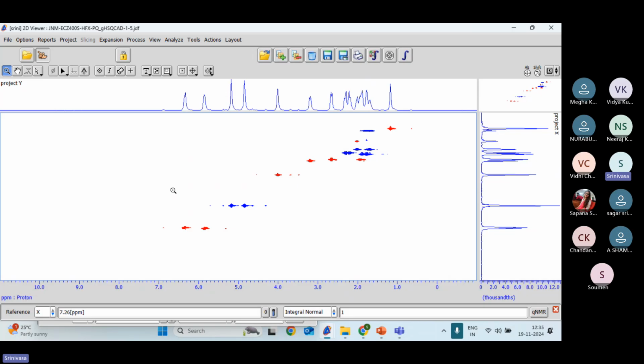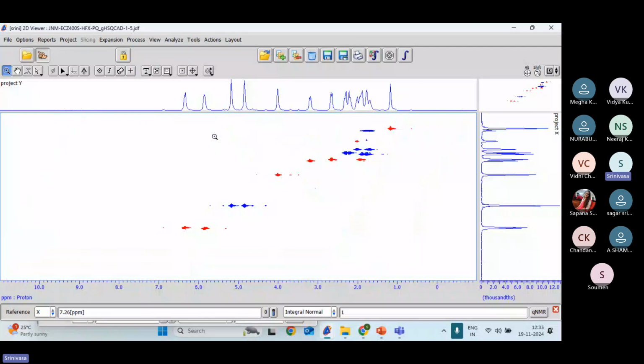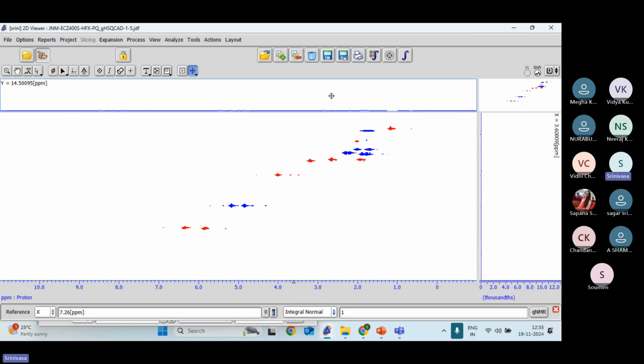This is to select different slices. 2D NMR means this number of slices, right? So you can see this is the one. This number of 1D slices like this. Now you have to select which slice you want to work on. In the context menu bar, go to the second option from last. Click here. Select, hold the line on the top toolbar. Now please consider only your horizontal line, not the vertical one. Okay, now the horizontal line is touching this red one here. I'm taking this. When you select this particular one, it shows the spectrum only for the particular slice.